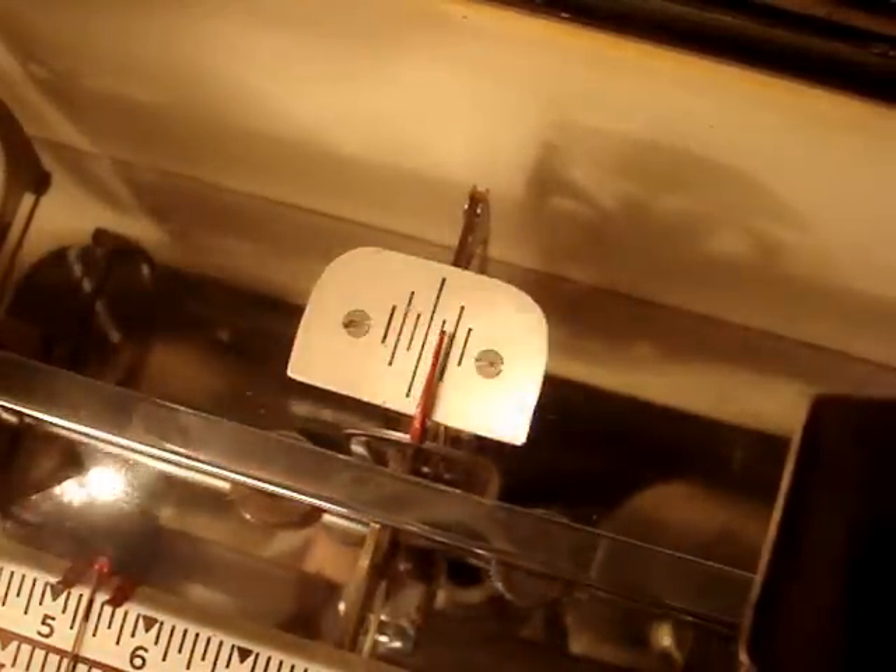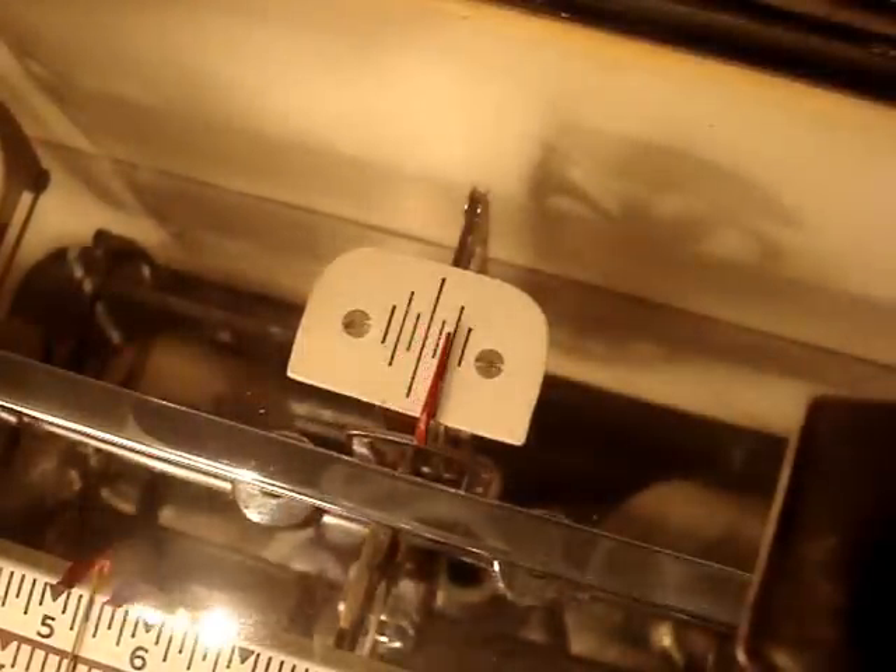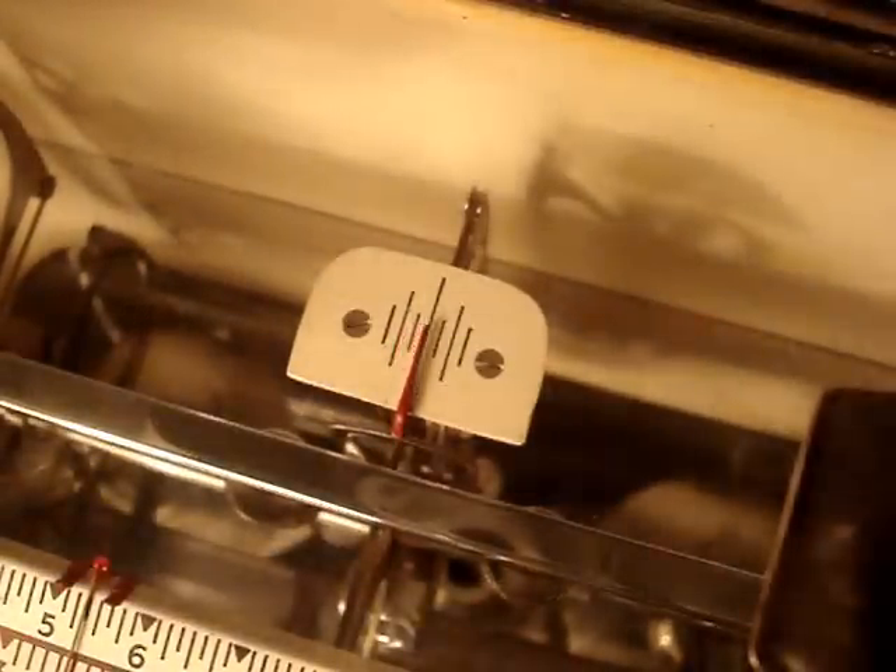So yeah, this is how we weigh stuff here. When we want to weigh multiple pounds using this scale, it takes quite a while — there's a lot of math involved. But anyway, this is the scale that weighs one gram, for your viewing pleasure.